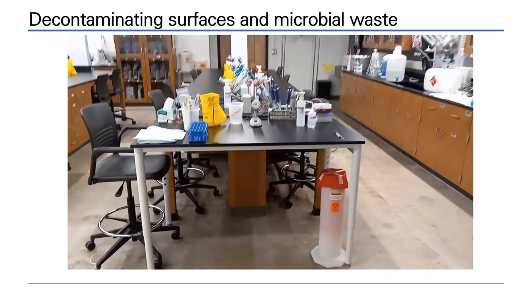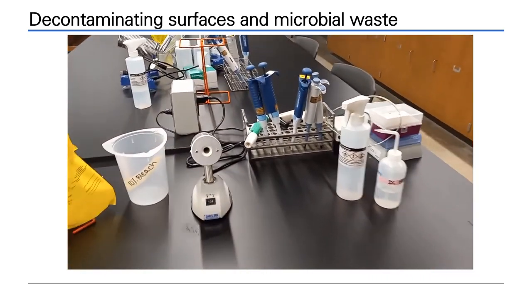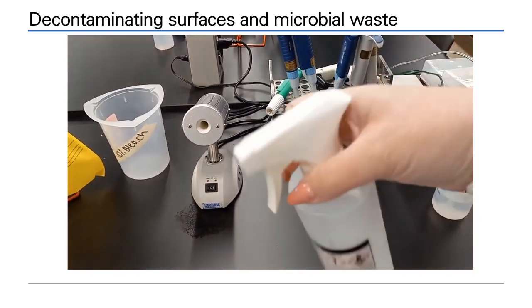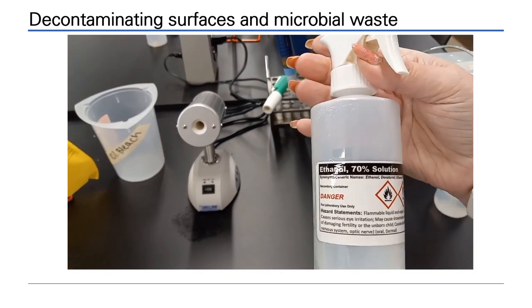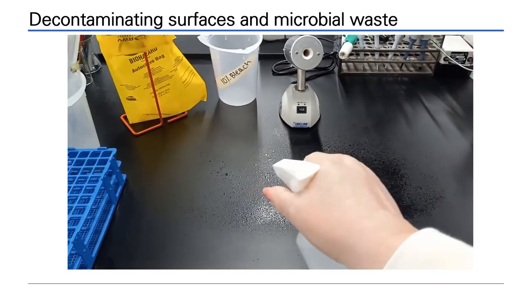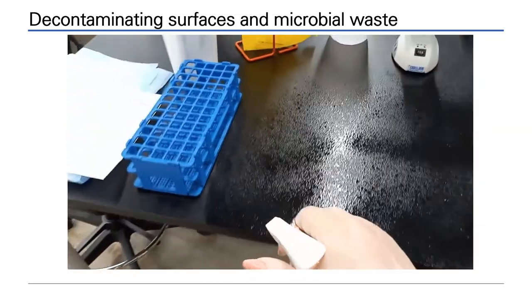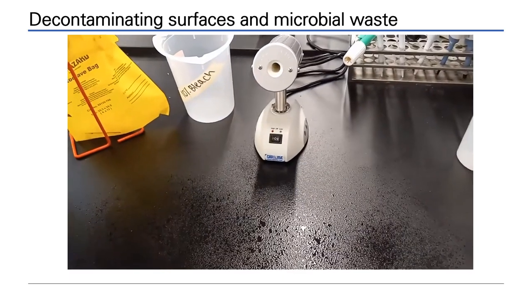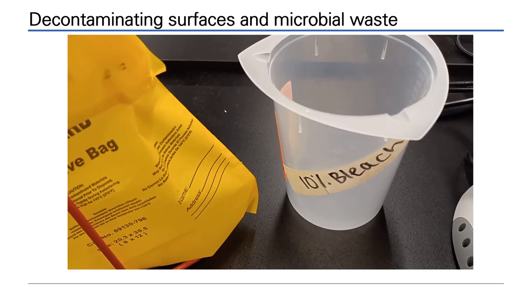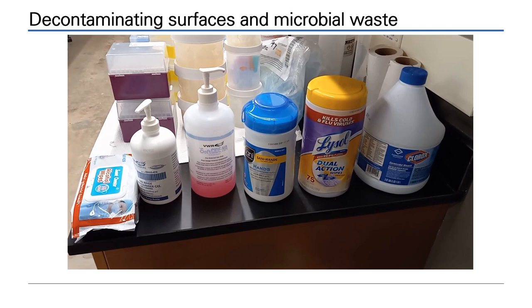In the microbiology lab, we use 70% ethanol and 10% bleach to decontaminate microbes. When you first start working, spray down your entire bench area with 70% ethanol and allow it to evaporate to kill microbes. Any liquid waste generated whilst working should be placed in the 10% bleach in the pot on your bench. The bleach must be made fresh each week. Other hand sanitizers are also available in the lab.